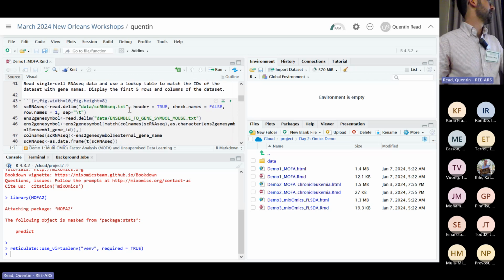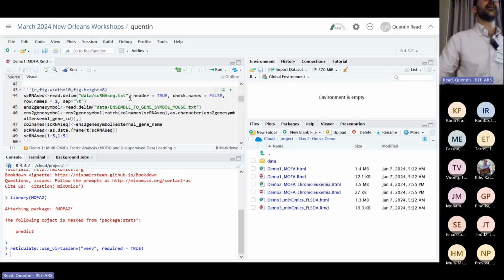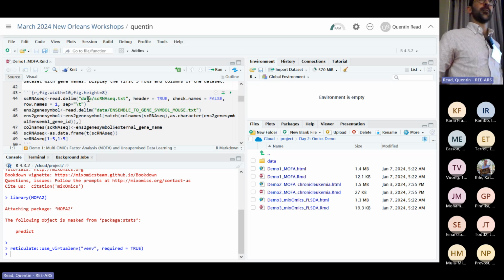And you can see I've also in the data folder, I have the data for today, the RNA-seq and the different methylome and everything all in there. So what we're going to do is just explore the data first before we actually start doing complicated models on it, because it's not very smart to do complicated models on something you don't know what it is.